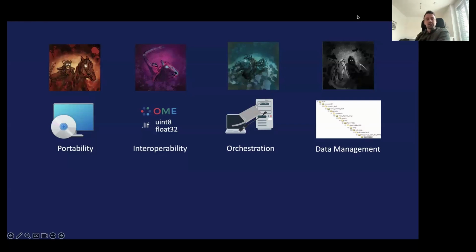And then for the rest of the apps like Fiji and Napari, you need to install plugins for both systems in order to connect to Arkitekt. So there's an initial cost of installation that we would like to get rid of with the rest of the Arkitekt developer team, by having a central Arkitekt instance that people can just connect to. But that's not there yet. So for now, this is the step that you need to take.